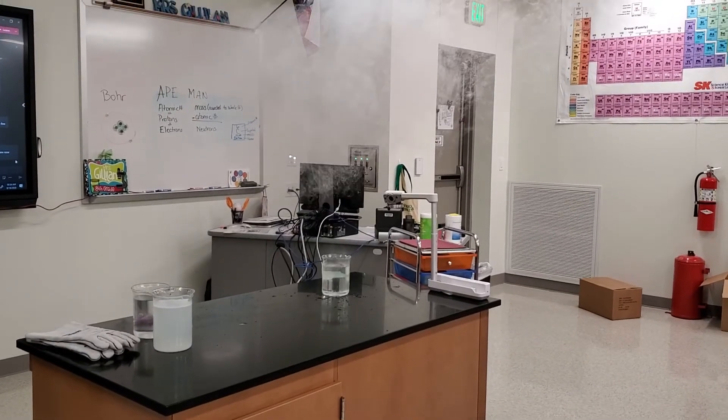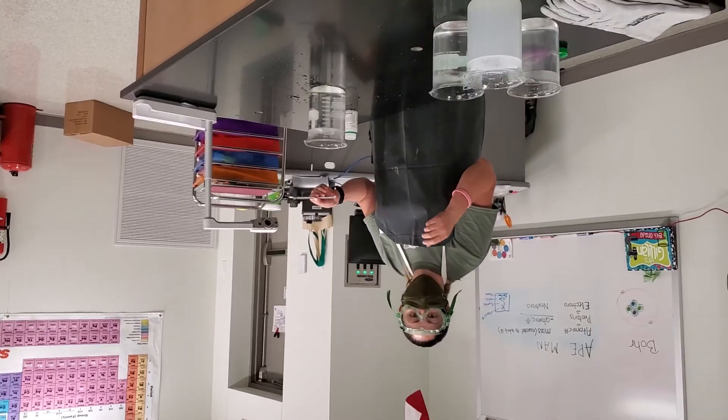Okay, so you can press stop. Potassium is next.